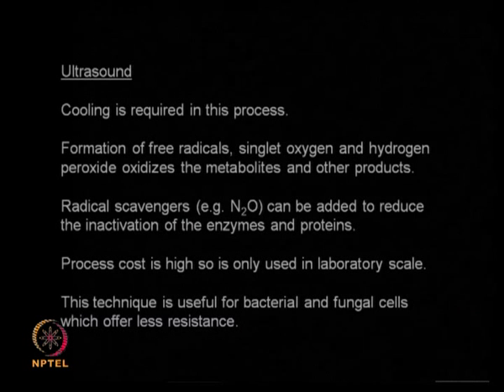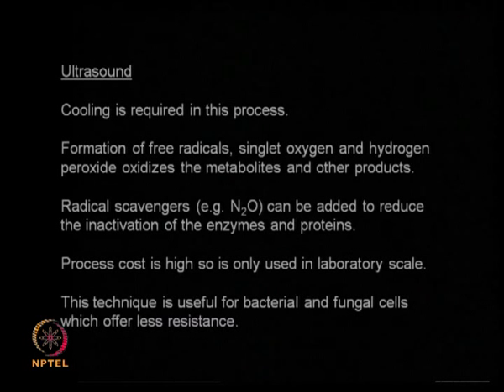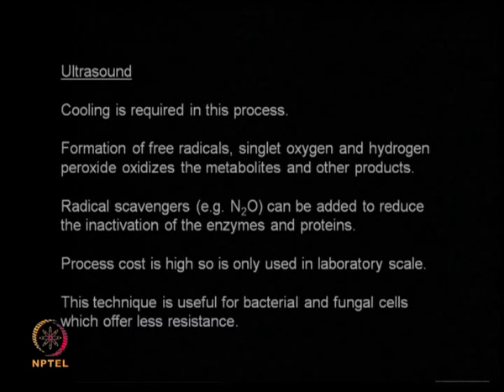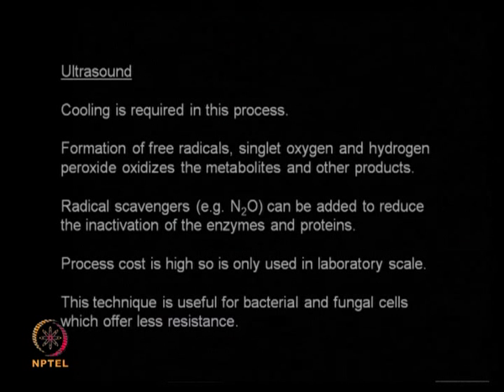Another problem is it can even generate free radicals, singlet oxygens. If you get singlet oxygen, you may be getting hydrogen peroxide, and hydrogen peroxide, as you know, is a very strong oxidizing agent. So it can start oxidizing the metabolites, and you may end up having an oxidation product which is not desired.